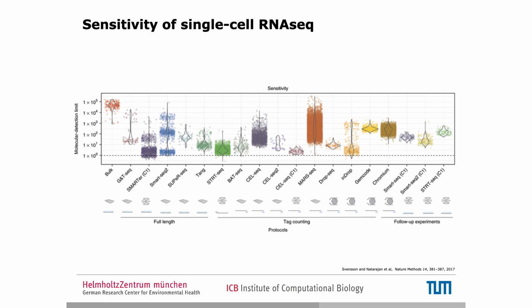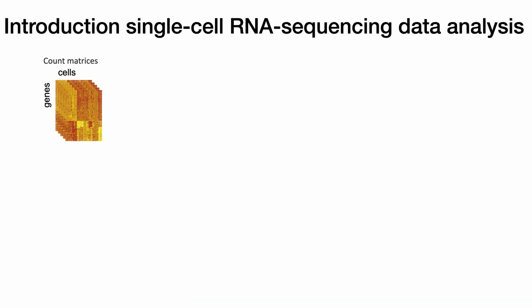Okay, so now let's leave the experimental session, and I would like to introduce you to the basic workflow. So we made the path from library prep to sequencing to mapping, and now we have our count matrix. And now we can analyze the data.